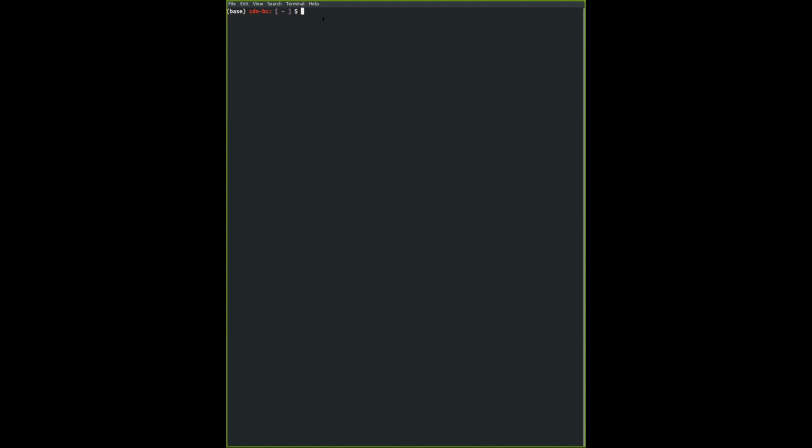The command to print out this directory explicitly is called pwd. So I'm going to type pwd. It's short for print working directory. And if you press enter, it tells you exactly your current working directory. So this is what we call a path, because this is the position or the location of your working directory in your entire file system.